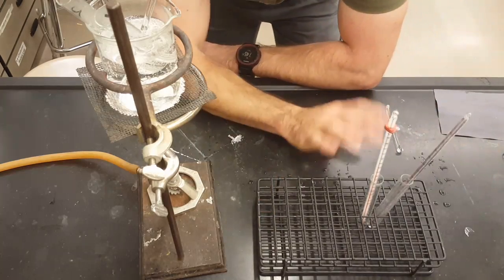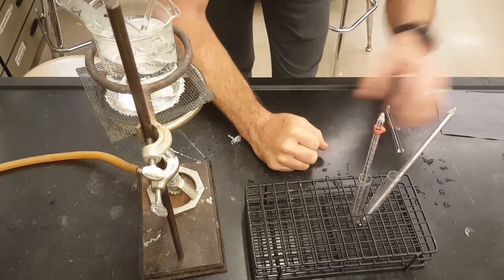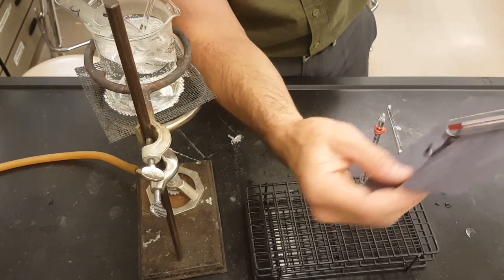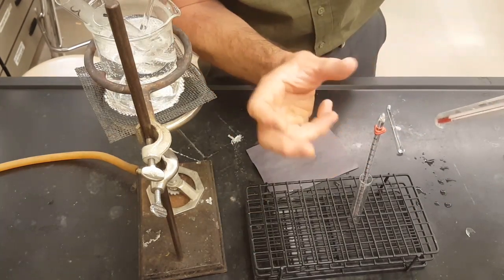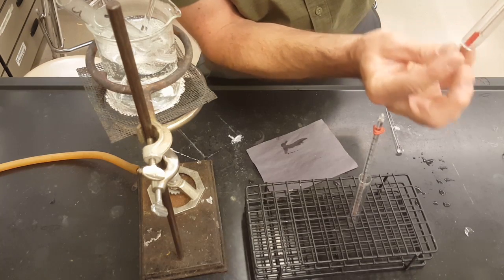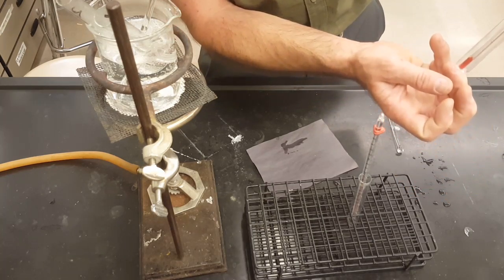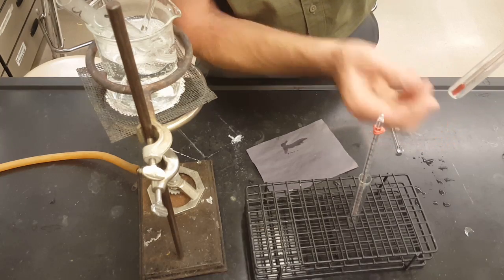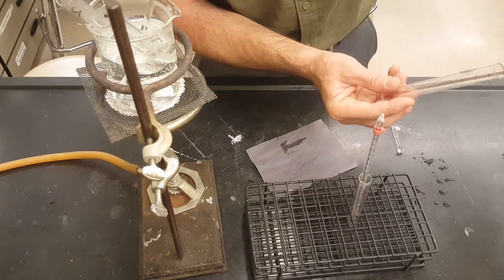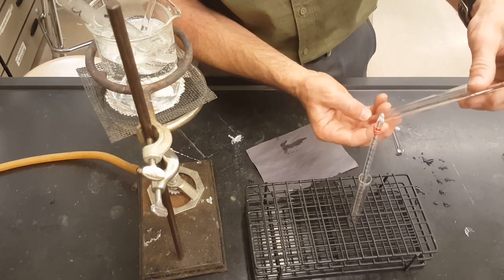And this is where you're going to eyeball, watch very closely your solutions. Watch and watch and watch. You can even pull them out of here, put a little piece of black paper behind to see contrast. As soon as you see any cloudiness appear or any white precipitate at the bottom, anything that's different than perfectly transparent, perfectly clear, if there's a change, then crystallization has begun, and that means you're at your saturation temperature. Look at your thermometer, take your temperature at that moment when the cloudiness first began, and write that down.